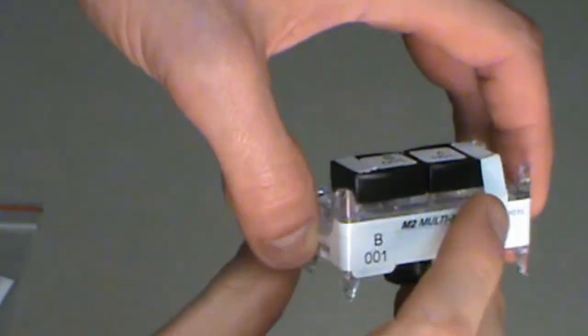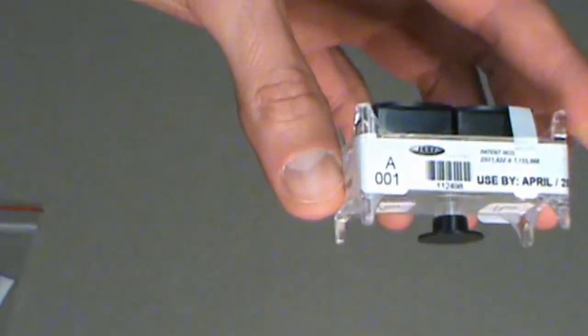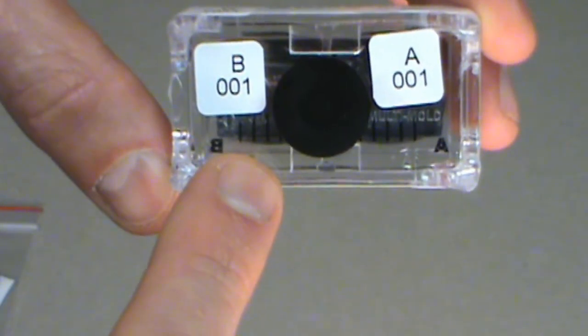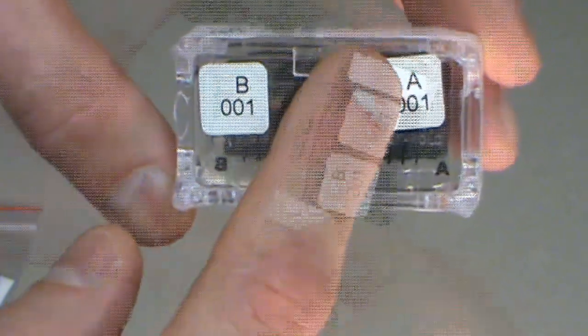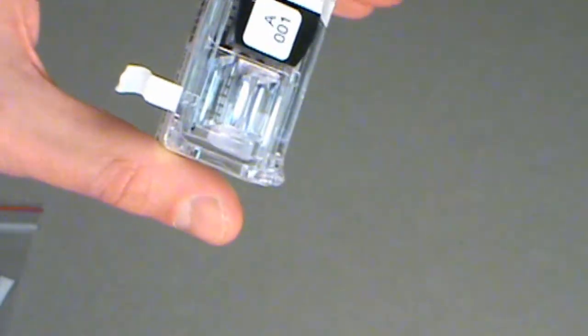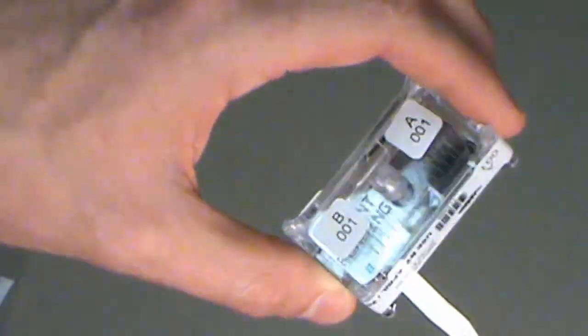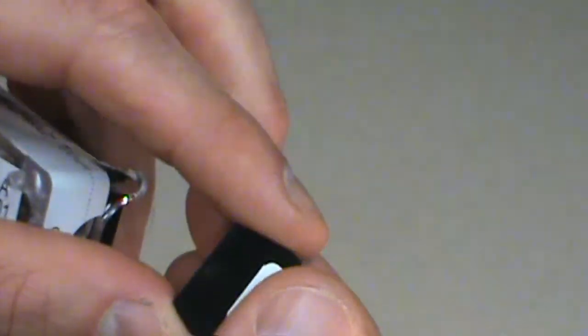You'll notice the mold cartridge has two caps on top, allowing you to collect two air samples with one cartridge. I have this cartridge covered in labels to help distinguish side A from side B. Remove one of the top caps as well as the back cap.